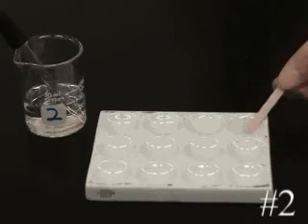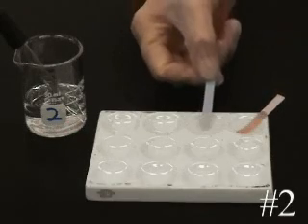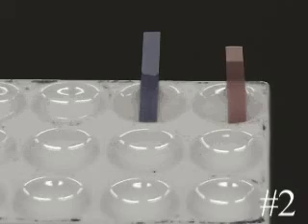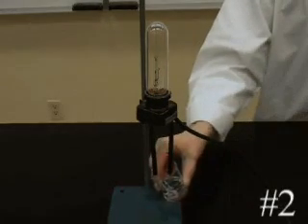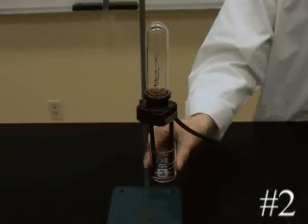First the red, and now the blue. Record your observations in the data table. As before, test the conductivity of the solution. Record this observation.